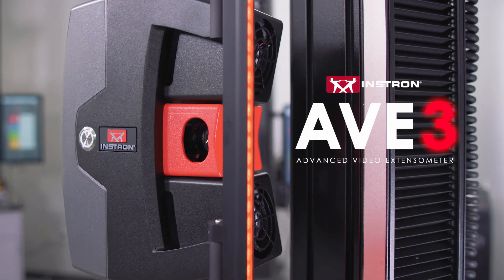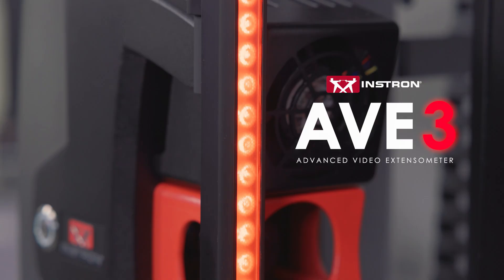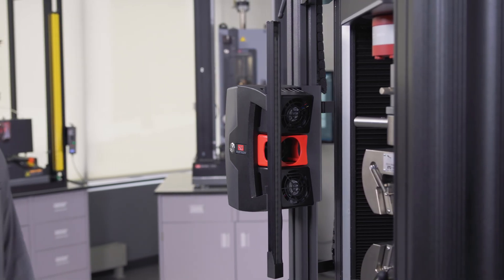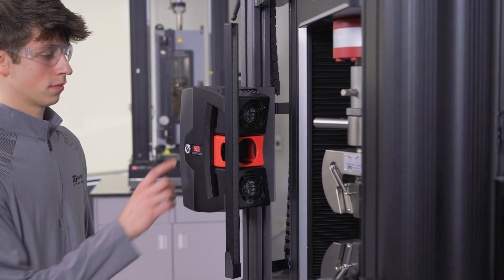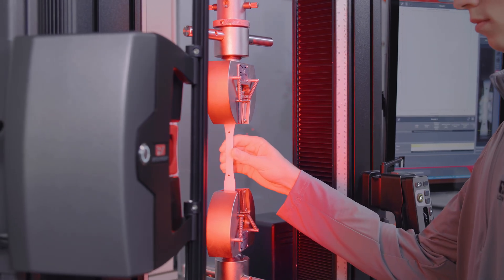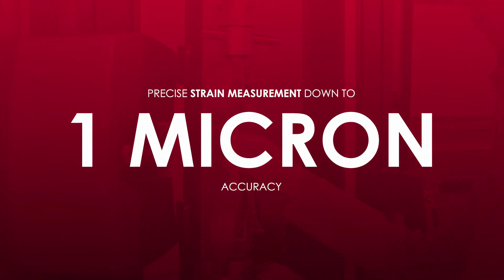Introducing the AVE-3, Instron's latest generation non-contacting video extensometer. As the premier extensometer solution, the AVE platform is unrivaled in versatility, offering unparalleled flexibility and precise strain measurement down to 1 micron accuracy.